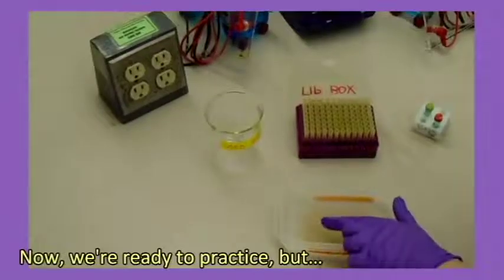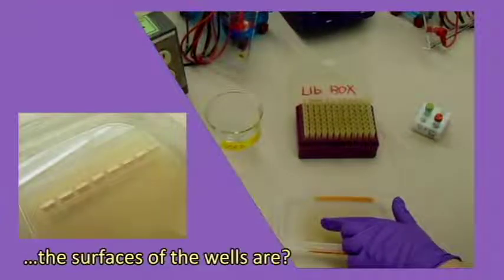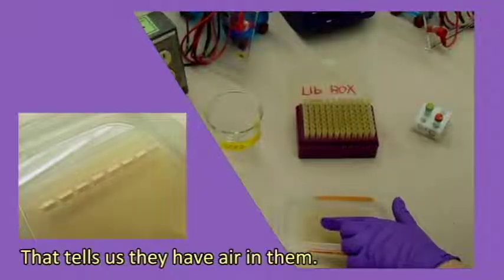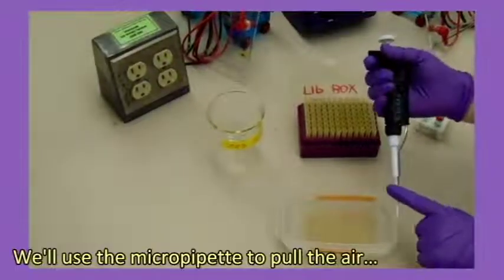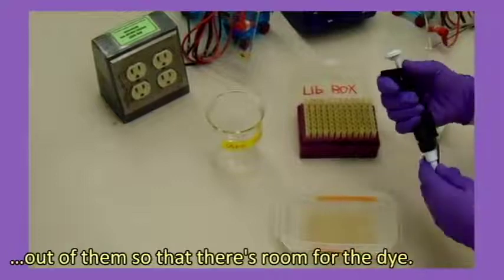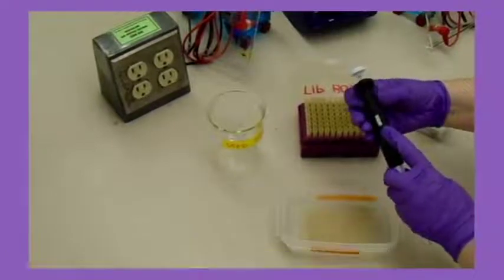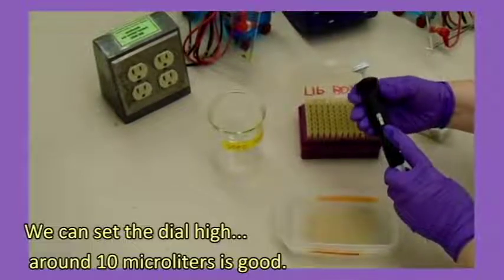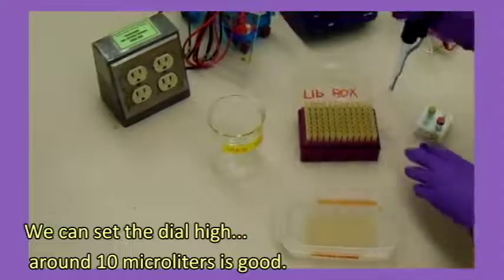Now we're ready to practice, but see how bright and shiny the surfaces of the wells are? That tells us they have air in them. We'll use the micropipette to pull the air out of them so that there's room for the dye. We can set the dial high. Around 10 microliters is good.